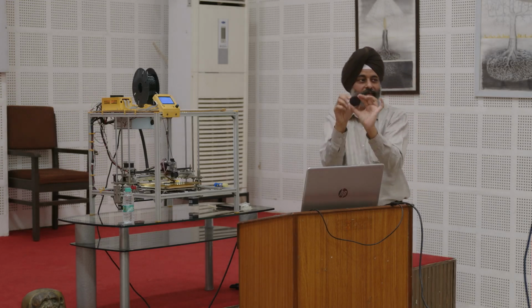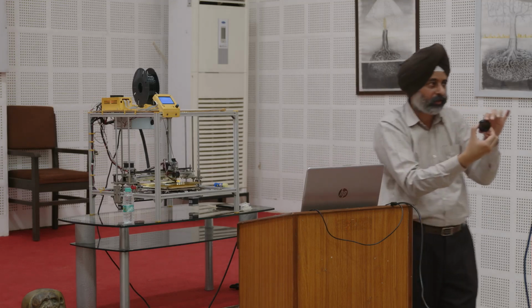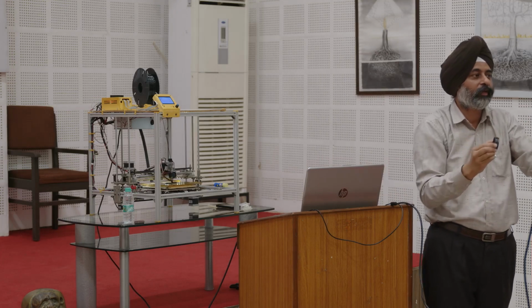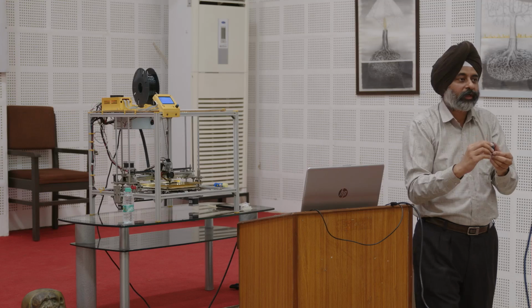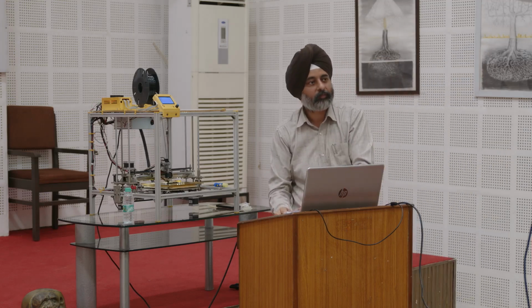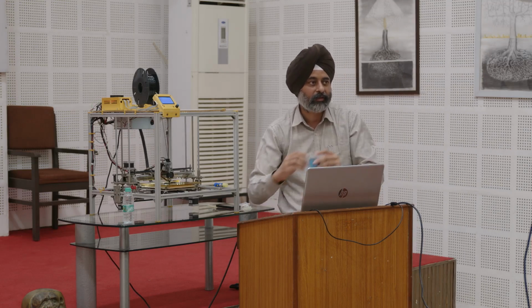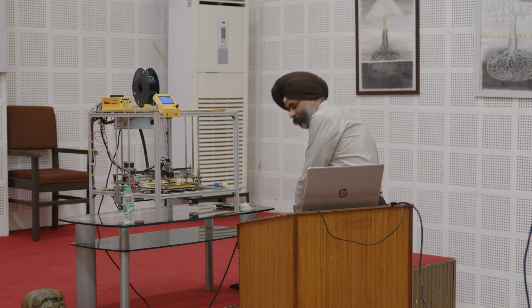So that is how a combination of a polarizer and analyzer works, both are identical. It's just the placement. The first one is called the polarizer, the second one is called the analyzer. What the polarizer does is convert the unpolarized light into plane polarized light. This is not a circular polarizer, this is a linear polarizer. The other one will stop the light.